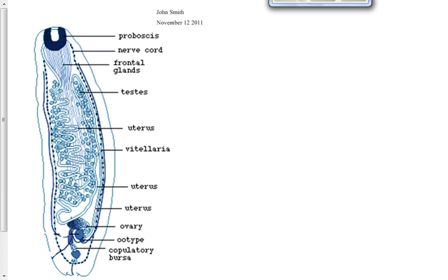This rectangle on the sheet that you have represents a sheet of paper. You don't have to draw a rectangle around yours. I see that happen all the time. The rectangle represents the borders of the sheet of paper this was drawn on, so you get an idea of how much of the page the drawing should take up.